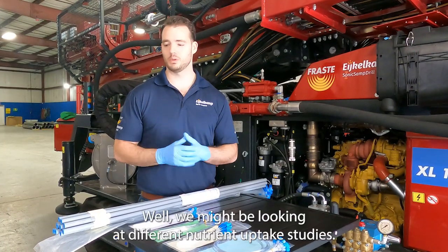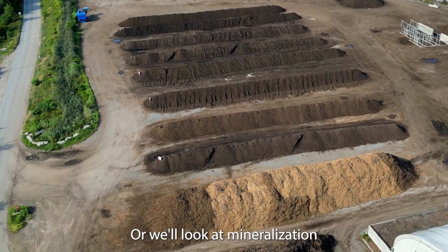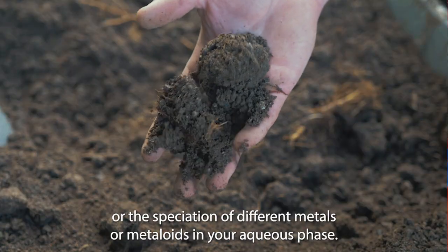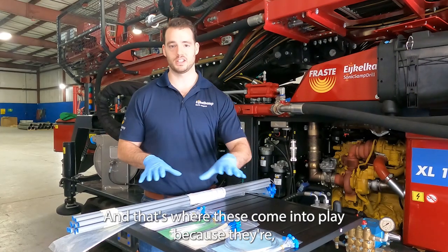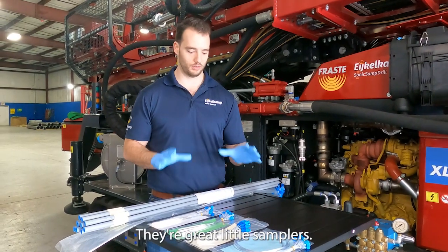Why do we want to do that? We might be looking at different nutrient uptake studies, we want to model mineralization or the speciation of different metals or metalloids in your aqueous phase, and that's where these come into play because they're non-destructive in a chemical manner. So they're great little samplers.